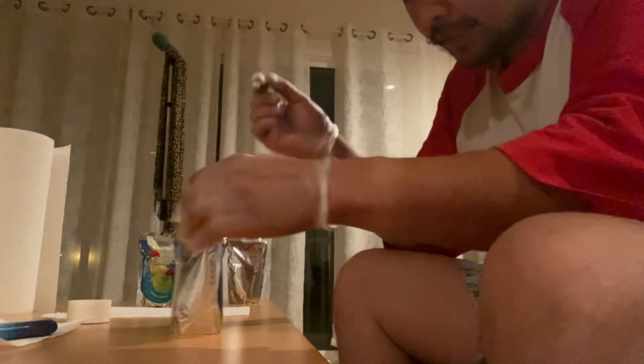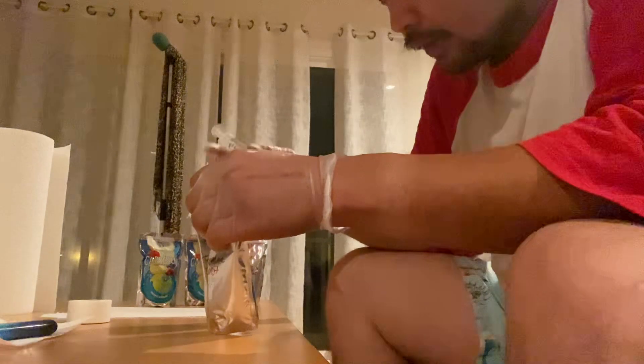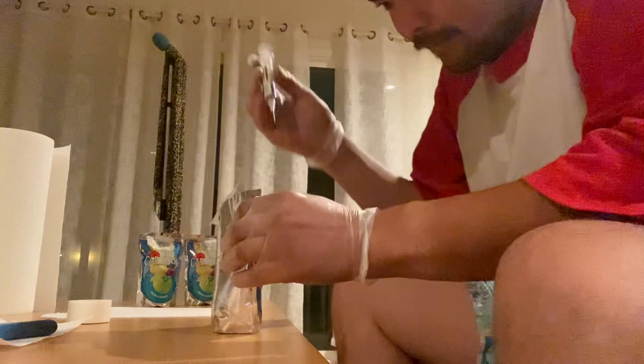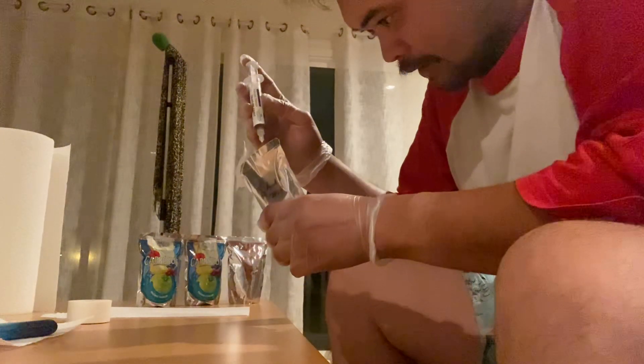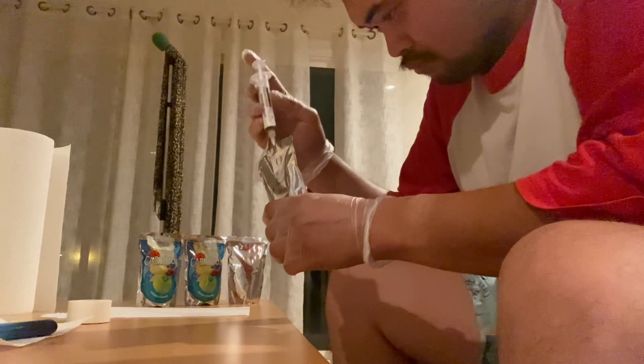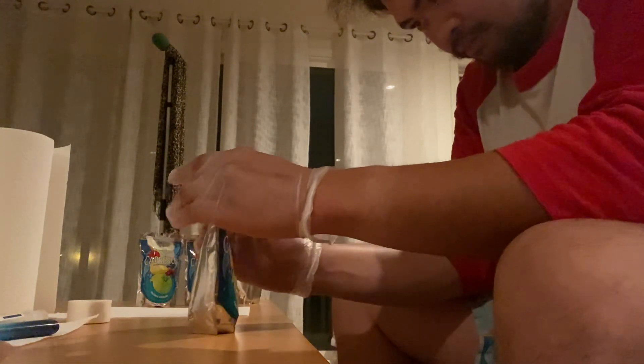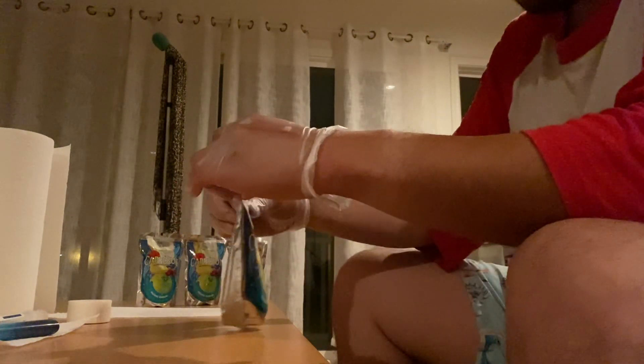Inject it directly into the straw hole and only put one to half a cc inside. Tap it. Plug it. Dated. Put it on the side.